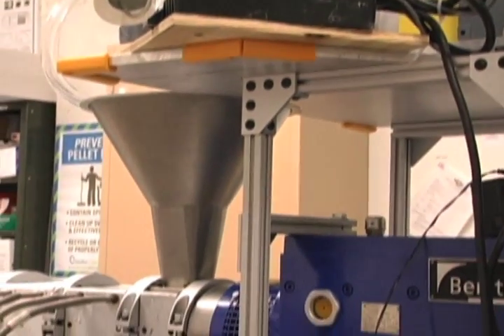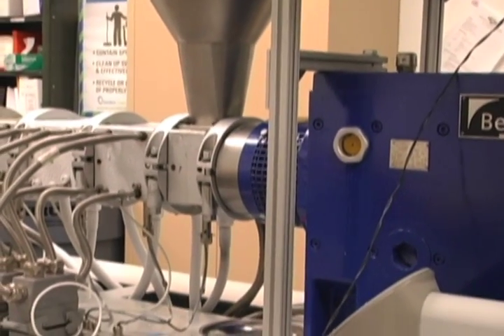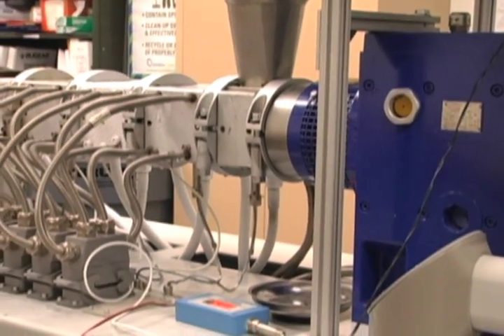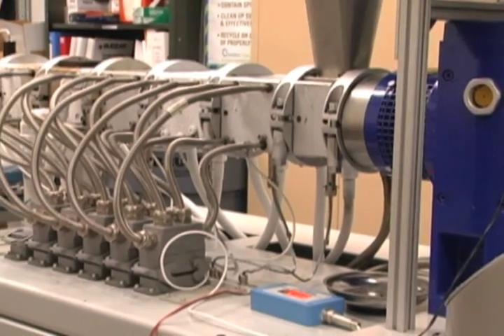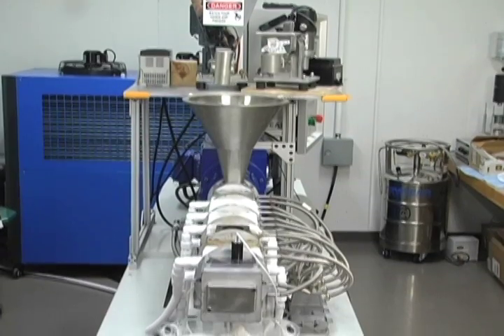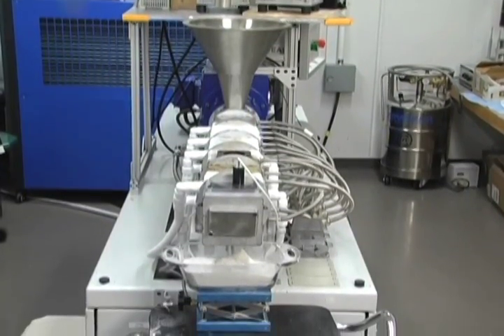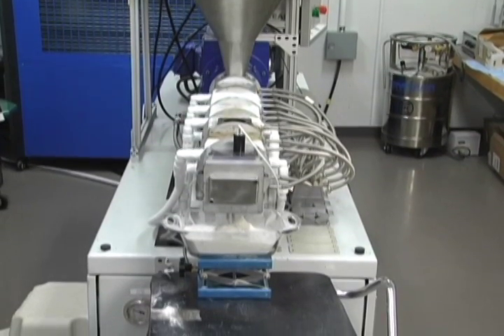The SSSP instrument is a custom-modified 25-horsepower twin-screw extruder manufactured by Krauss-Maffei-Berstorff Corporation. It employs 25-millimeter diameter co-rotating intermeshing screws with an L over D ratio of 35.